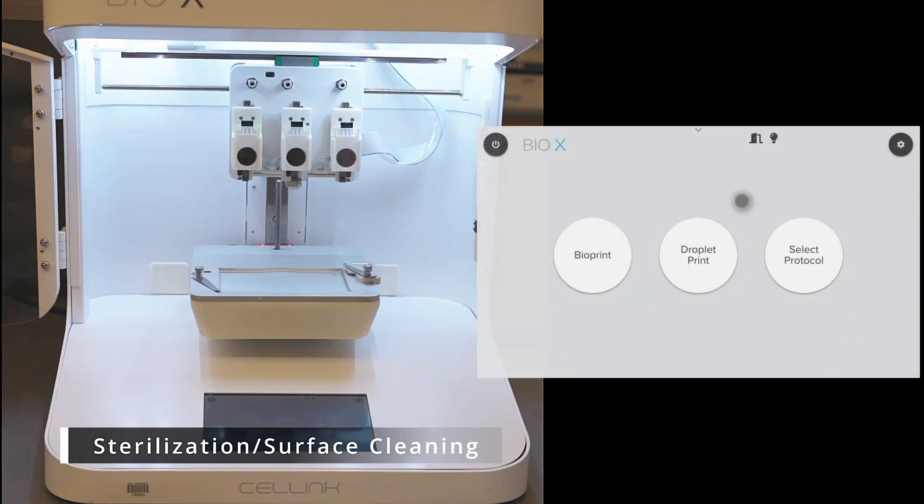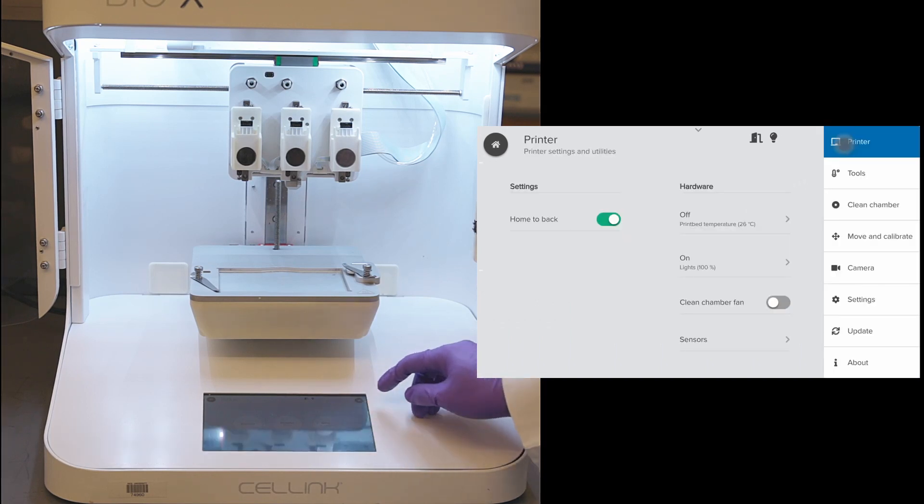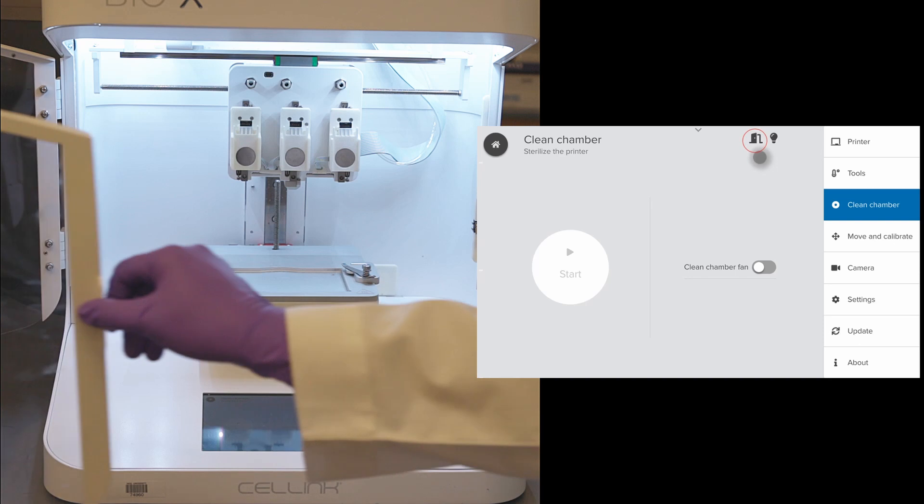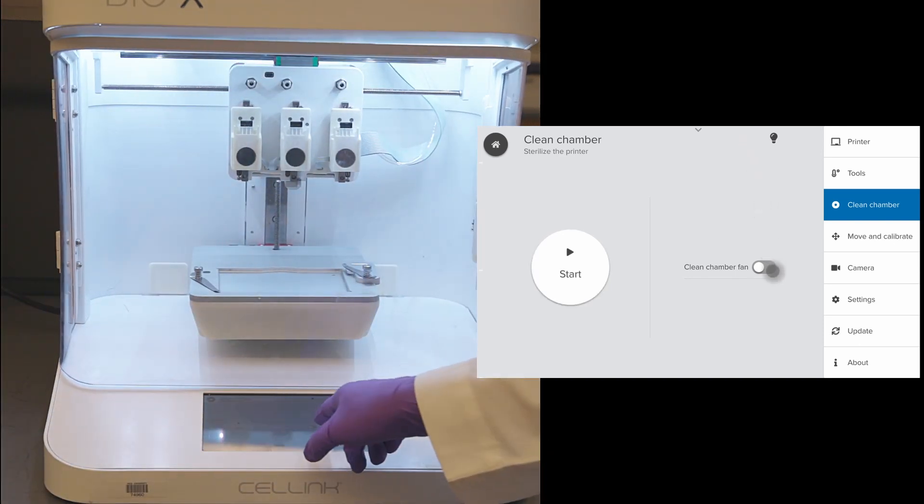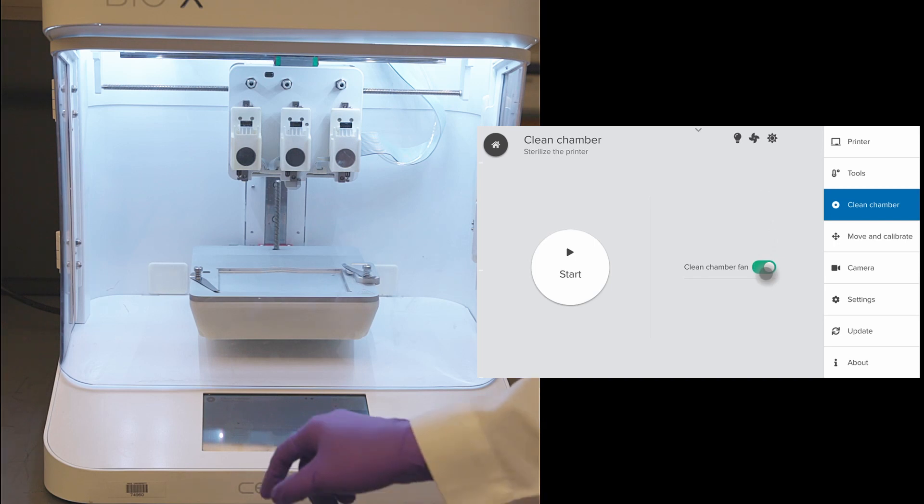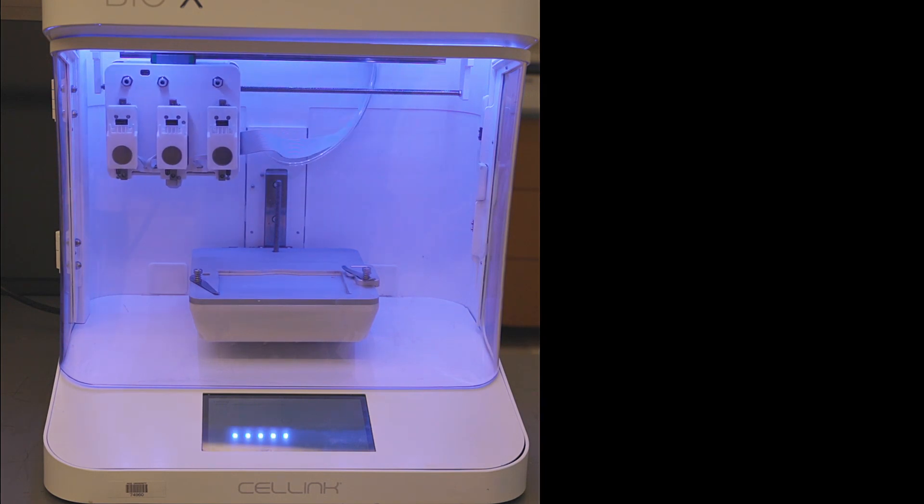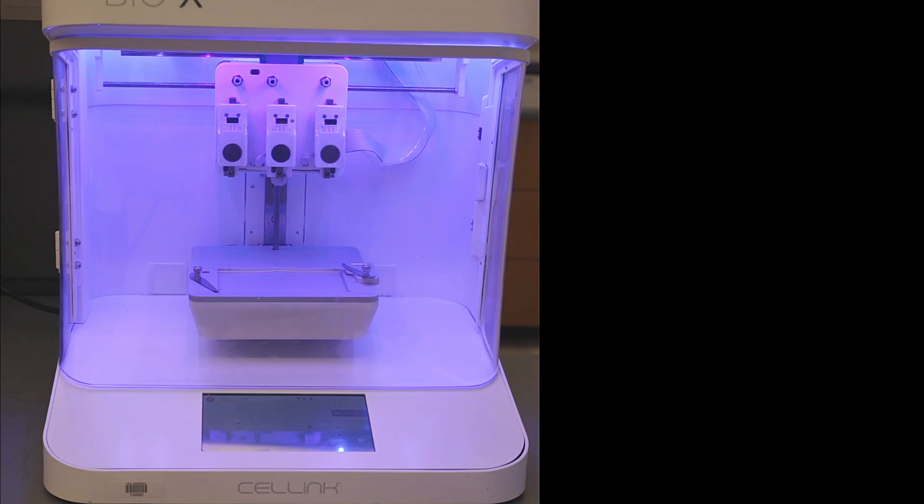To clean the chamber before bioprinting, click on settings and click on clean chamber. The door needs to be fully closed and secured to run the clean chamber protocol. We can enable the clean chamber fan and click start. The UV light is turned on for surface disinfection. After completing the process, the UV lights are turned off.